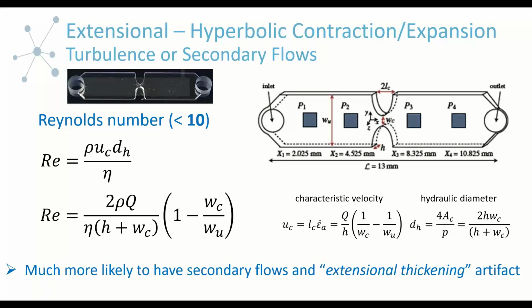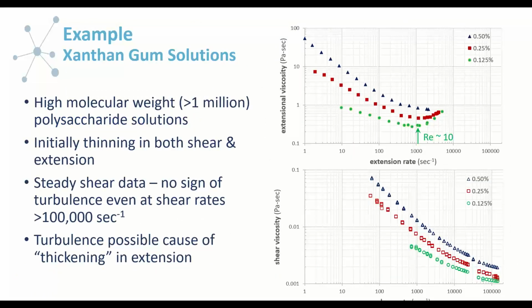this is not true, because what's happening is, you can imagine that when you have all this chaotic flow where now we're not moving in a single direction, it's artificially going to bump up the stress, but it's not related to the true viscosity, it's related to the flow field being in this chaotic state. So let's look at some data just as an example.